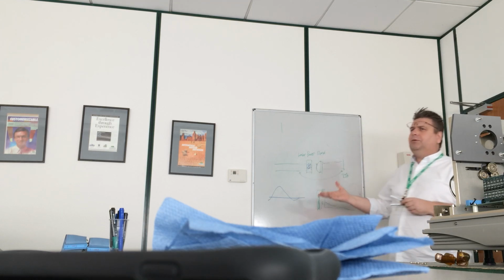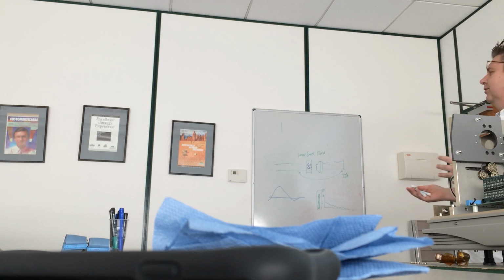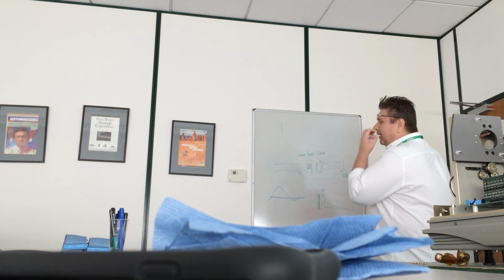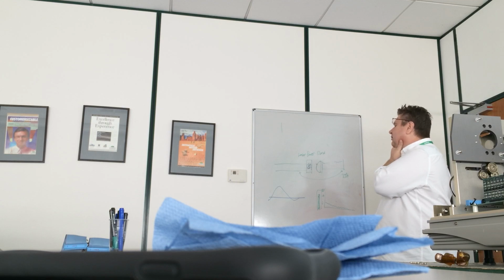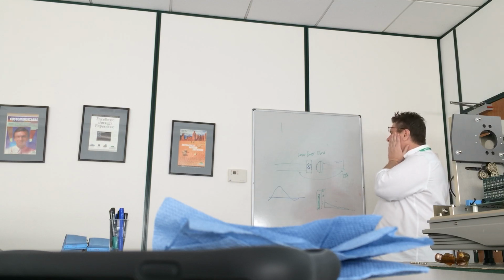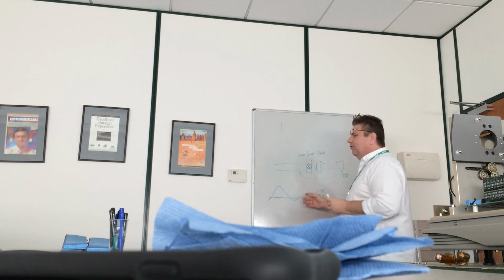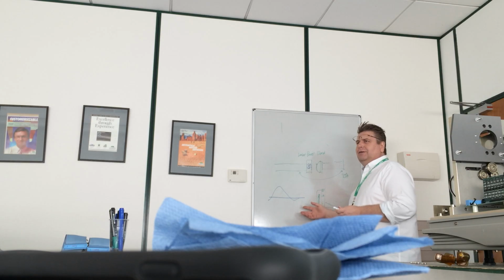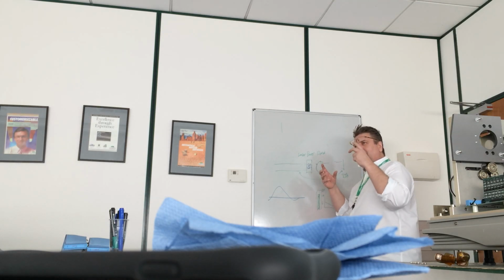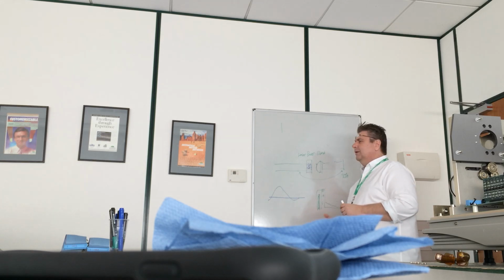Companies were wrestling with this problem for years and years and years. And of course it was so obvious. I mean, we figured it out in 1996, 97 with the invention of the 2000. And we struggled with this one for years on the Mastersizer S and the Mastersizer X. Why couldn't we increase the resolution? You know, because the background was taking the data away.